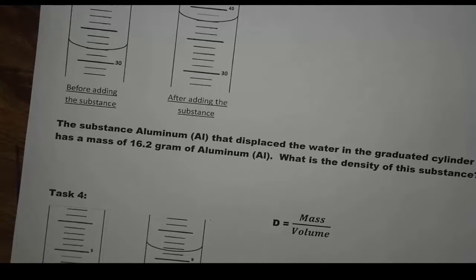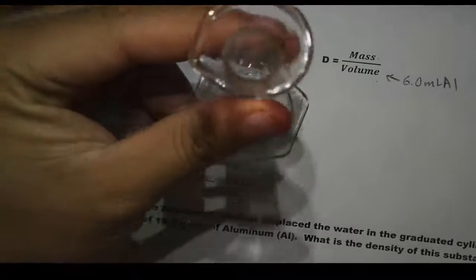Before we move on, let's look at a specific example. In this case, I have a graduated cylinder, 10 milliliter. Notice how there is no substance here, and the reading is about 5 right there. You can see that, right? So, in this case, I don't have aluminum, but I have copper. Look what happened when I added in the copper. You can see that it is increasing the volume.